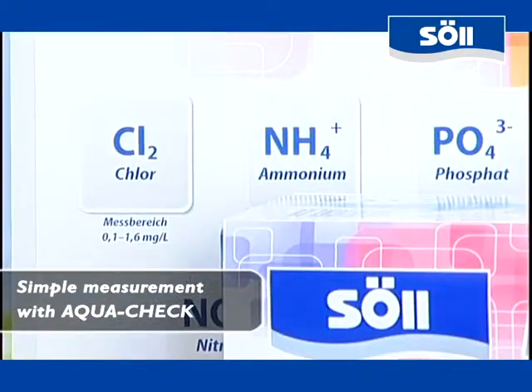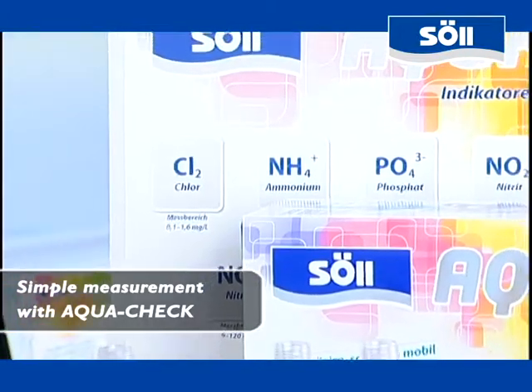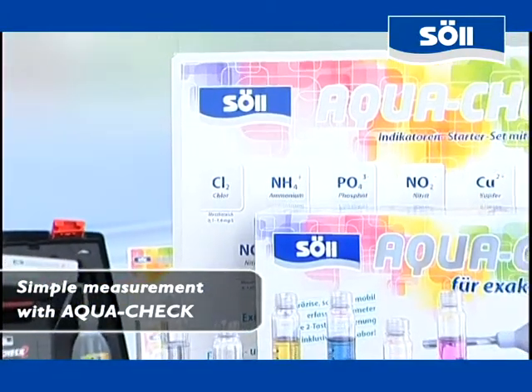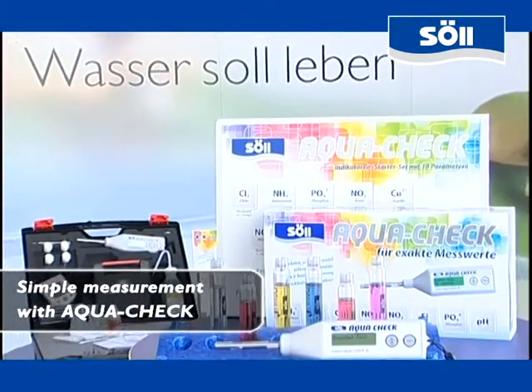The AquaCheck photometer enables you to determine up to 11 water parameters with lab-level precision, but independently from laboratories. We want to show you the simple handling of the device by using the examples of the pH value and the phosphate test.